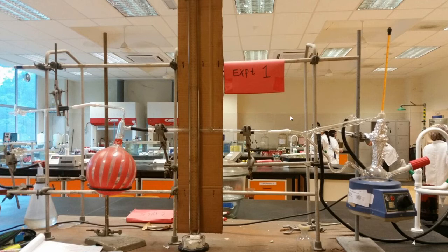So you wait until it boils, get the value of the boiling point, and then get the final value of the difference between the two levels of mercury, which is the pressure on the manometer. Then you start increasing again.